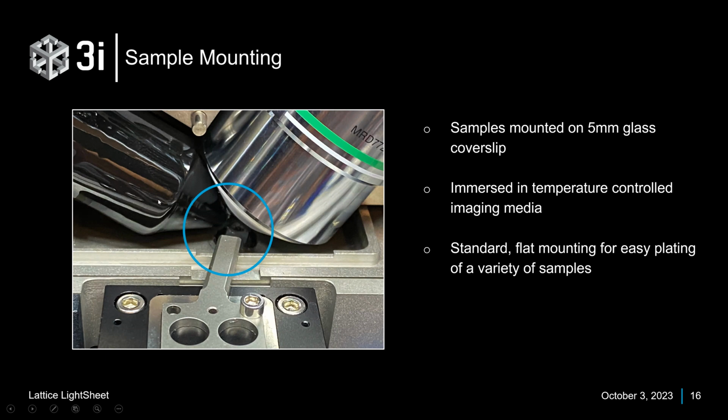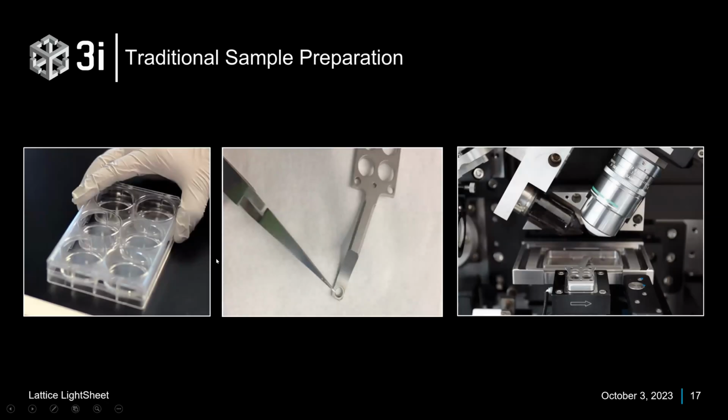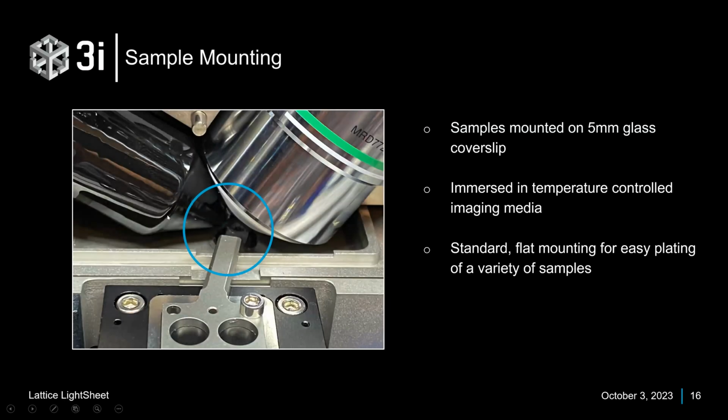Well, you also have to squeeze in an excitation objective that fits without hitting. Usually if you put two high NA objectives together, you can't co-focus them and you'll run into actual steric hindrance on the sample. So this is a custom developed objective that fits within the envelope of the detection Nikon lens. This is from a company called Special Optics. The gap between these lenses is a couple hundred microns. So you can see it, but barely.